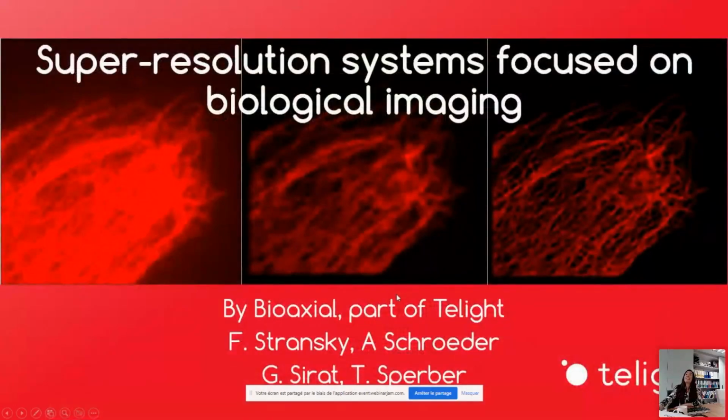Once again, today we're going to be talking about super resolution microscopy systems. And for those of you who may not work a lot with microscopy, or may not work particularly with super resolution, that simply means being able to see fine structures that otherwise laser scanning microscopy with light wouldn't be able to define.